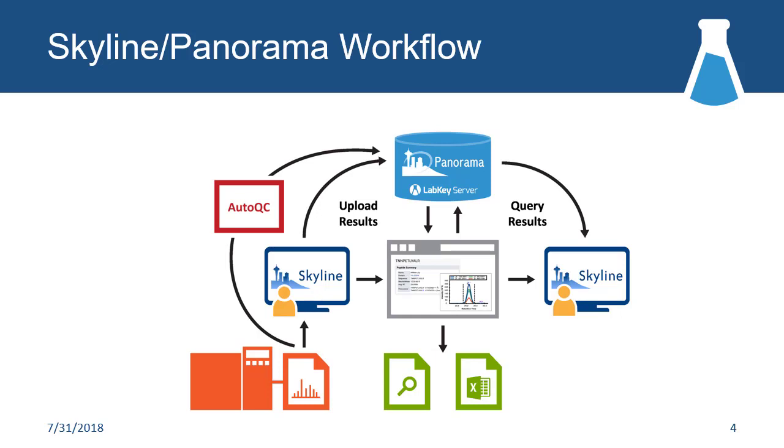And there's a variety of other scenarios you can use Skyline for in that command line mode. If you are looking to do an automated workflow, you've got a high volume of samples that you want to have consistent analysis on, you can set up a pipeline using a scripting tool or the like to run a bunch of data through Skyline without having to manually interact with it.